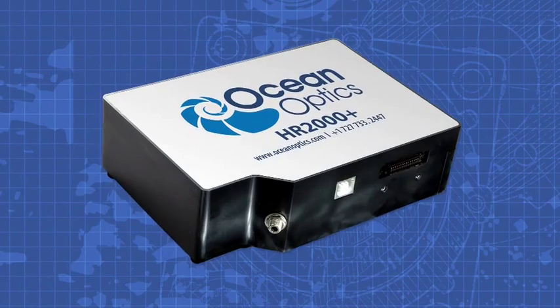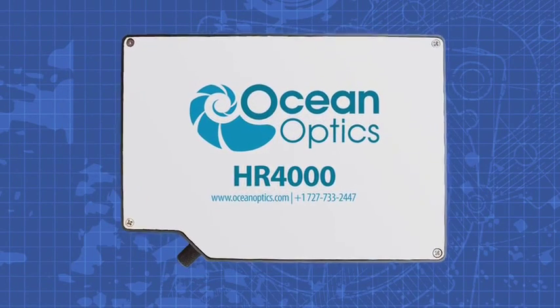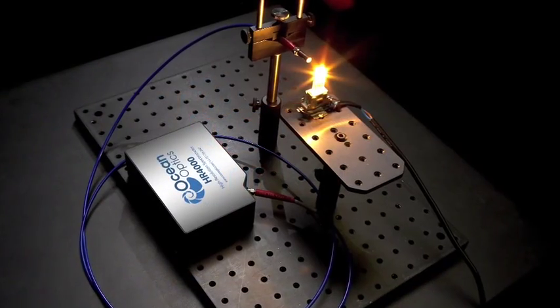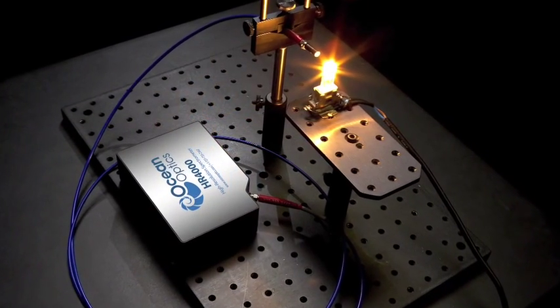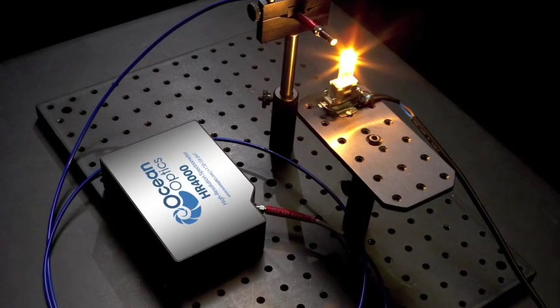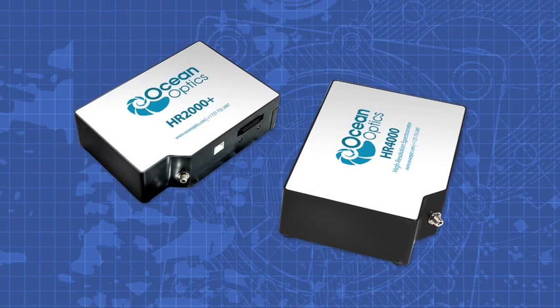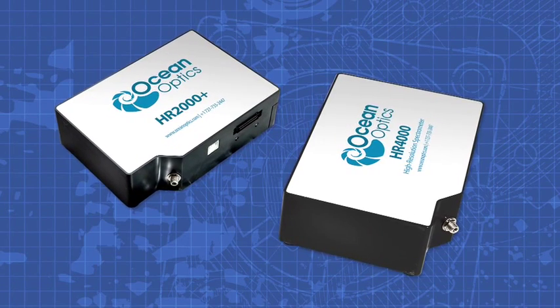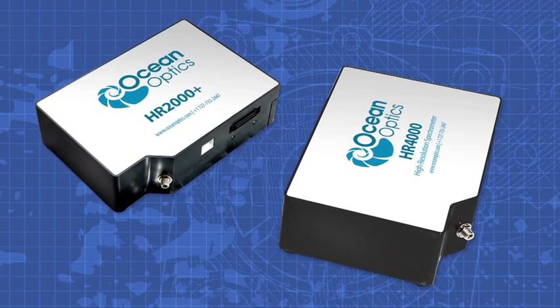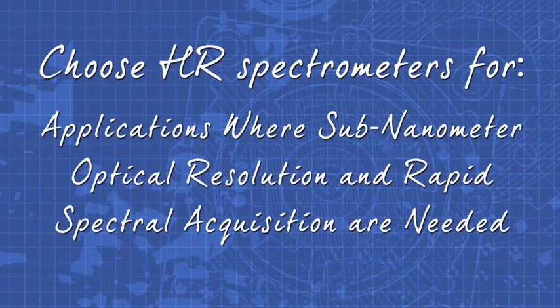Get to know the versatile high-resolution HR spectrometers from Ocean Optics. HR spectrometers have a high-resolution optical design and super fast electronics in a robust yet compact footprint. Choose from two detectors and a range of gratings and slits to optimize your spectrometer just the way you need it.